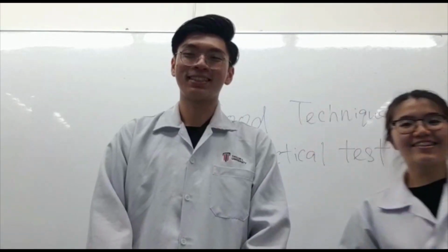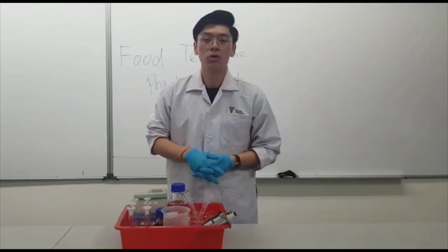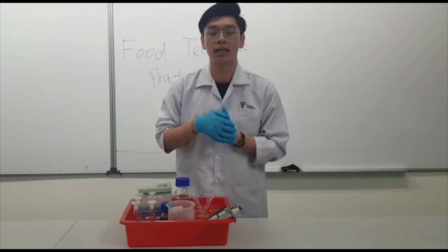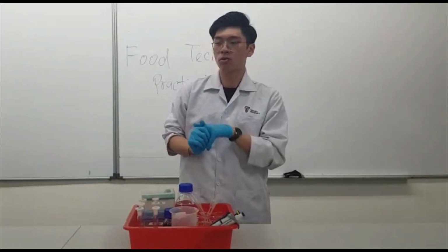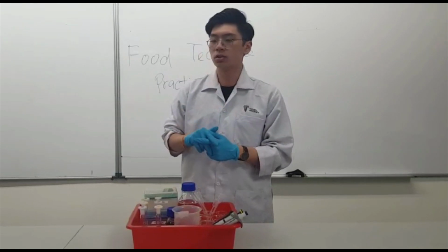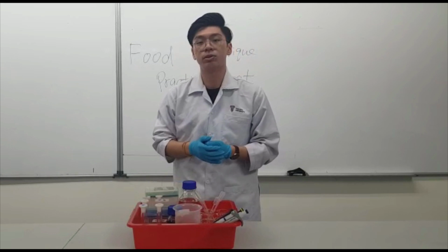Hi. Okay, so today we are going to do the HPLC, which is high performance liquid chromatography. HPLC is one of the techniques in analytical chemistry, where we separate and find out what compounds are there in mixtures of solutions. Not only can we determine which compounds, we can also detect their concentrations and retention times.